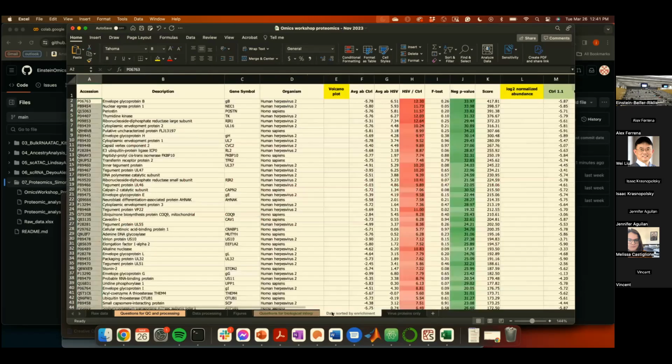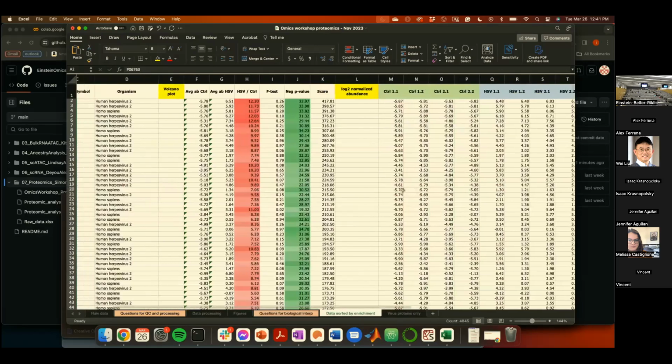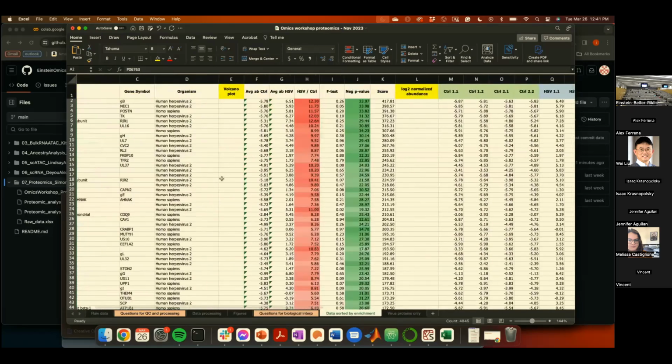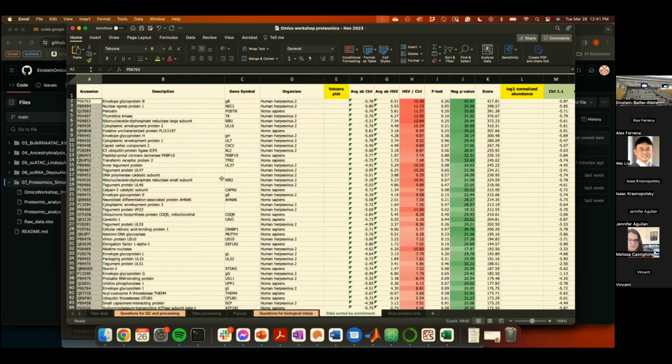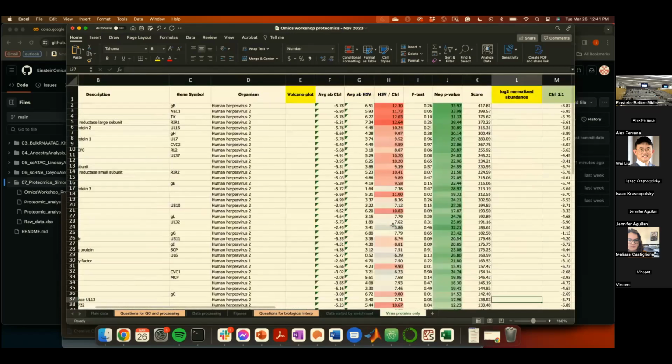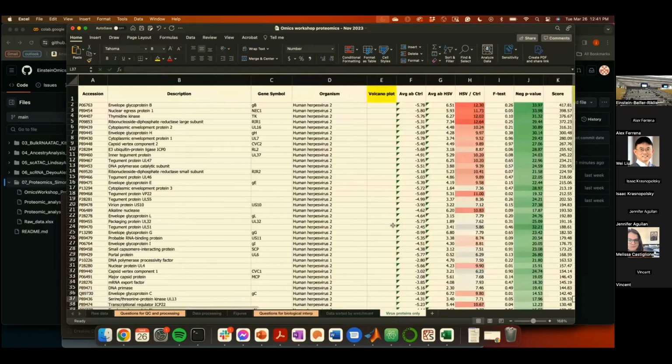Finally, using the things from this sheet, you can actually copy and paste some of these outputs onto the website that does GO-term enrichment analysis. This part I didn't do with my code because I didn't know how to do that, but I encourage you to look into it. Everything you need, if you don't want to deal with the code, is in this sheet. So I encourage you to follow along.